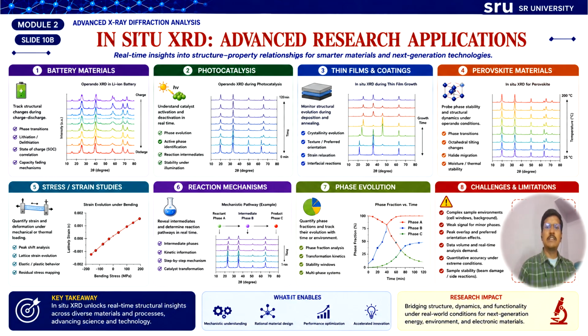The data analysis can also become complex because diffraction patterns continuously evolve with time. Despite these challenges, in situ XRD remains one of the most powerful tools for understanding dynamic materials behavior.